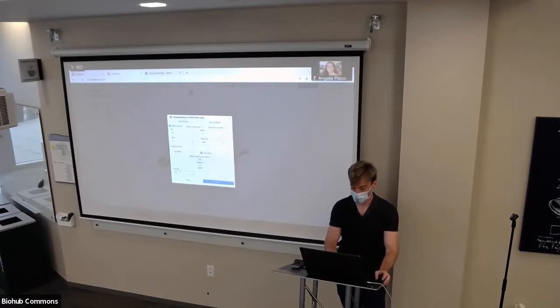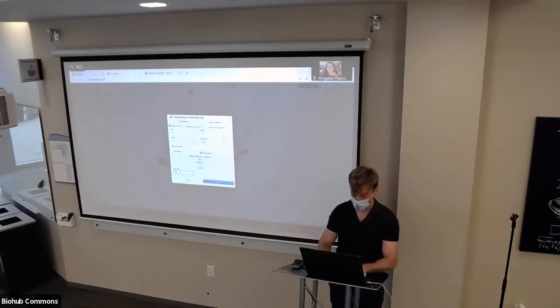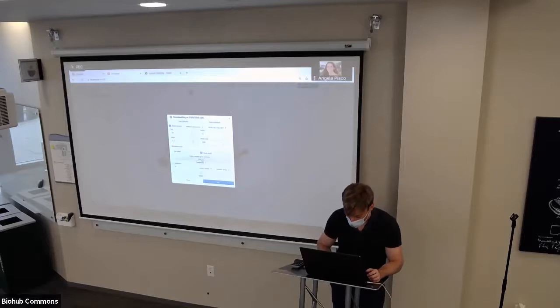This is like the minimum distance between cells. You can make it like 0.1 in Euclidean space. That's the default for UMAP. ScanPy's default is 0.5, but we'll just leave this as is. Okay, so just to review and make sure that everything's selected properly. I don't think I changed anything. Okay, cool. So now we'll hit run.